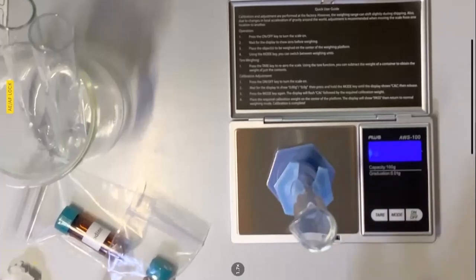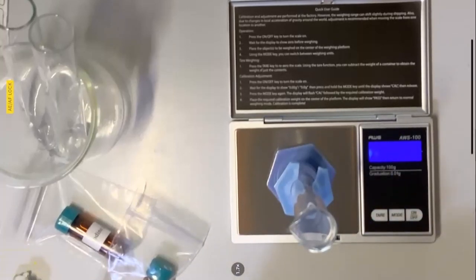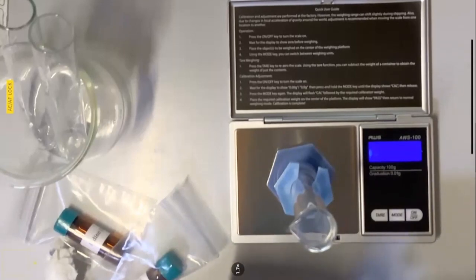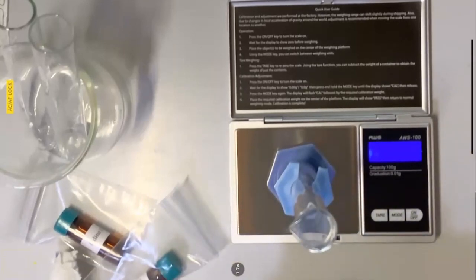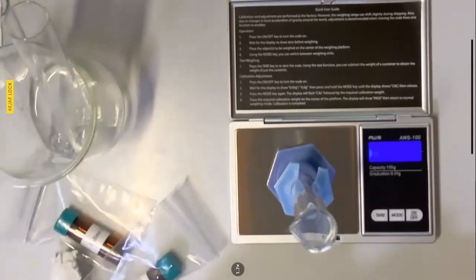But let's say that everything's clean. You do the procedure again. You take liquid B this time. You read the mass. And then what I'm going to do is pour a different amount in my second tube, okay? If I pour about 3 milliliters on my first, I'm going to try and pour 2 milliliters on my second.